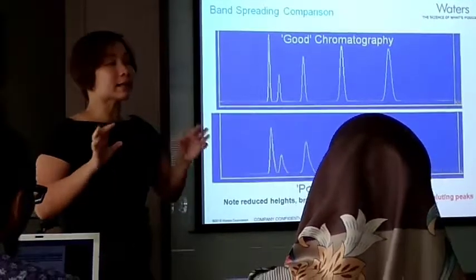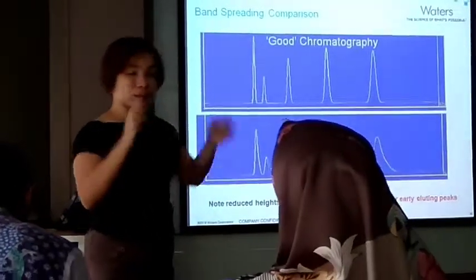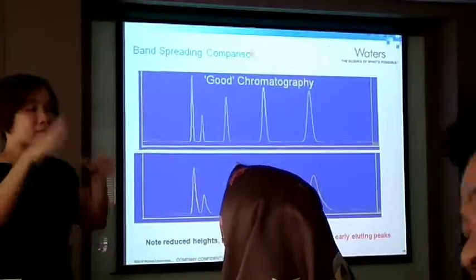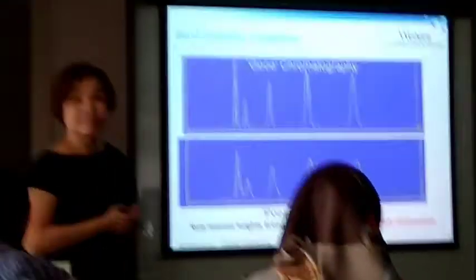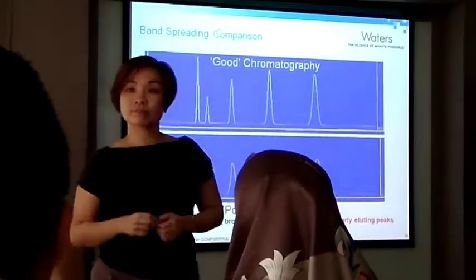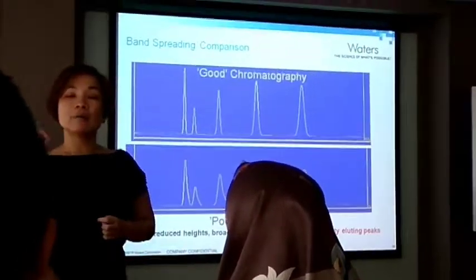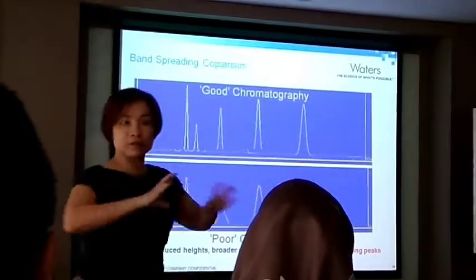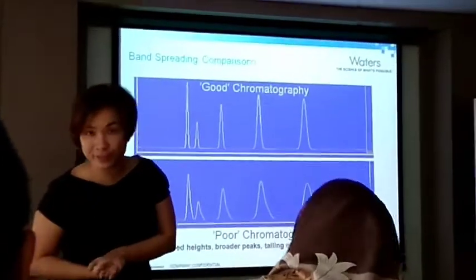A lot of customers did not realize that this will cause you to have a leak or sometimes a broadening of the peak. What is the good tubing, plastic or stainless? There's no good tubing. Okay, tubing at different parts of the system, you have to use different material.